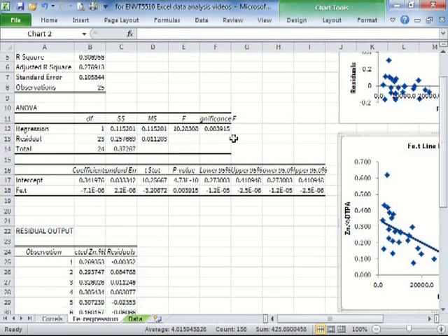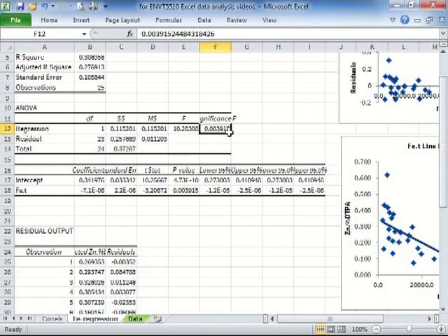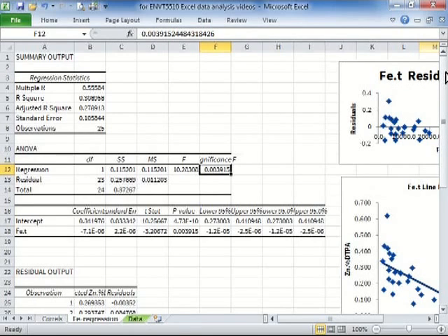We've got some statistical testing of the relationship. So here's the significance, or basically the probability of getting the relationship that we have got there if the null hypothesis is true. That is, the null hypothesis if there's no relationship. Alright, and we have an R² value which is not all that flash, of about 0.3, so say 30% of the variance in zinc extractable by DTPA is explained by iron concentrations. Right, we've got some statistics on our intercept and multiplier for iron.